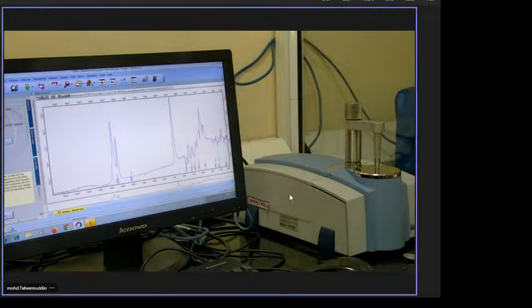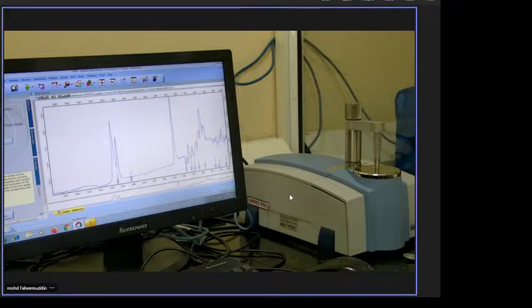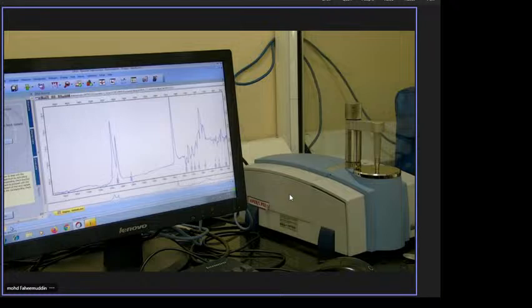Same light, same compound, in IR spectroscopy. The natural frequency of these electrons is different from the natural frequency of sigma electrons. But the IR natural frequency is very close to the stretching and bending vibrations of functional groups. For example, OH functional groups always vibrate like this, stretching and bending. These stretching and bending vibration frequencies are very close to IR frequencies, then absorption takes place.